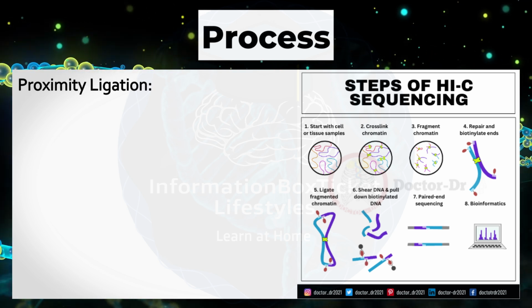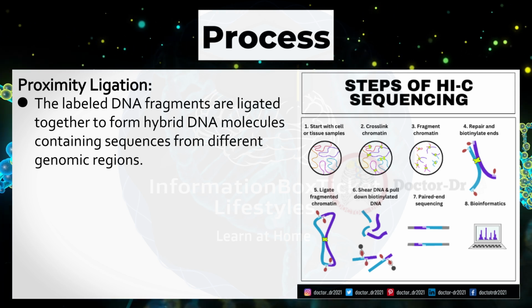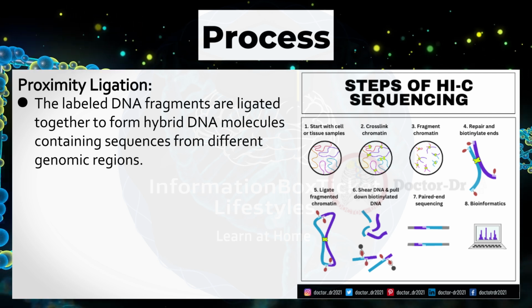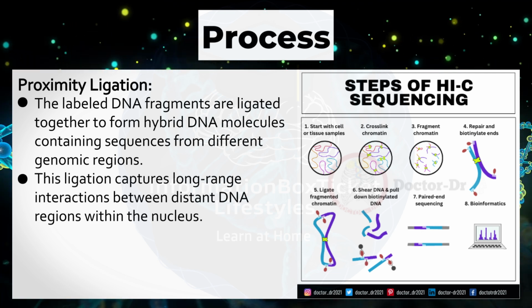Proximity ligation. The labeled DNA fragments are ligated together to form hybrid DNA molecules containing sequences from different genomic regions. This ligation captures long-range interactions between distant DNA regions within the nucleus.